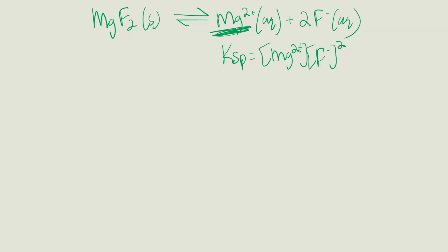Well, even though we won't have to make the graph or do the Beer's law calculations, hopefully, the instrument needs all that information. So just like when we did our spectrophotometry lab earlier in the semester, part A's job is to make standards of known concentrations, so that the instrument can figure out the extinction coefficient. So in part A, our job is to make solutions that contain magnesium of known accurate concentrations. So you're going to be doing dilutions with magnesium. And for this lab, it's going to be magnesium chloride.